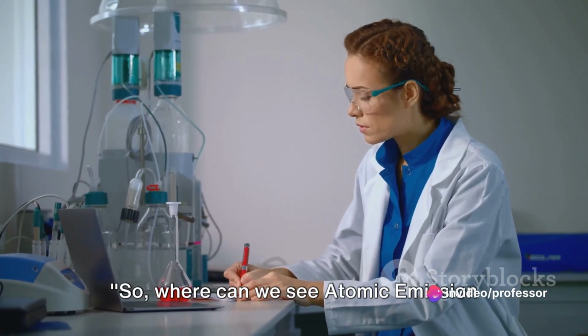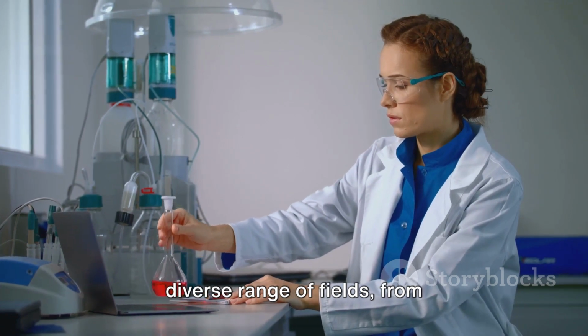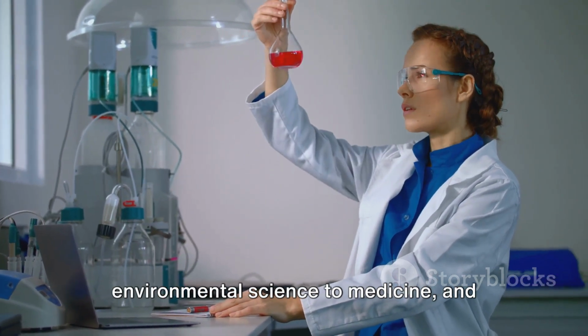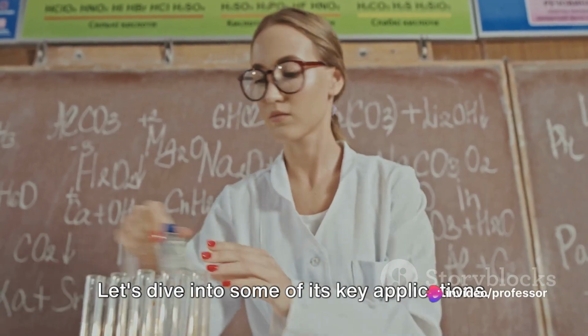So, where can we see atomic emission spectroscopy in action? Well, this powerful tool has found its place in a diverse range of fields, from environmental science to medicine and even astrophysics. Let's dive into some of its key applications.